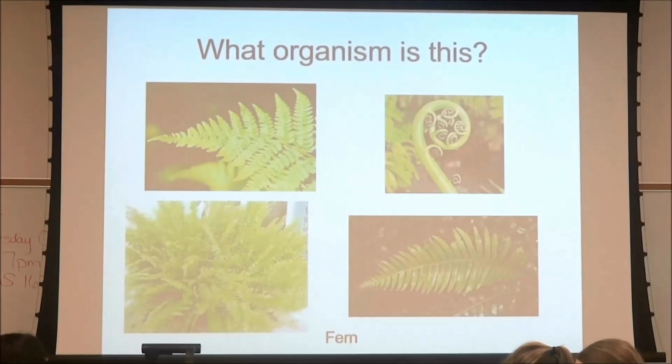Okay? Now, one more important thing about the fern that's not on this slide. Do you guys remember the name of the gametophyte stage that you had to measure? That heart-shaped thing? The heart-shaped thing, yes. What's the name of it? Starts with a P. It's the prothallus. Okay? So make sure you guys also know that the gametophyte of the fern is the heart-shaped prothallus.